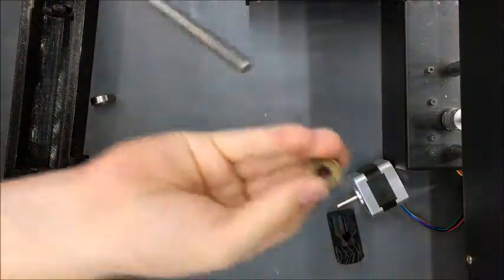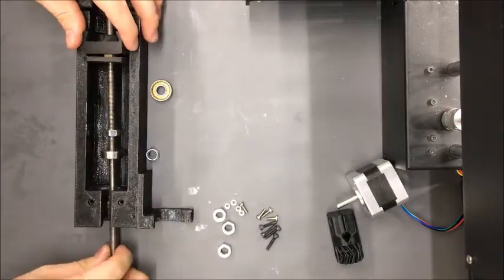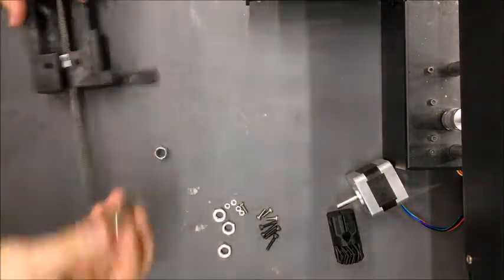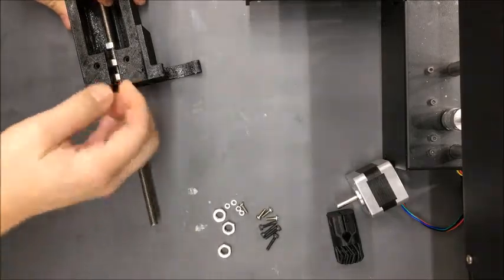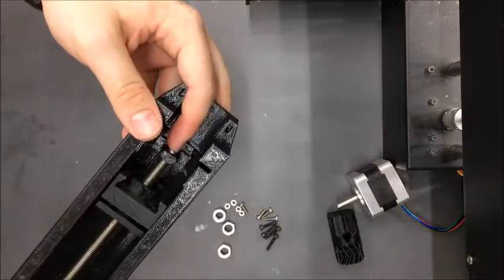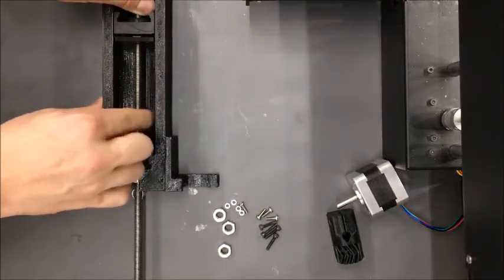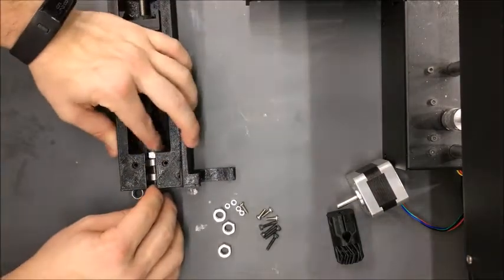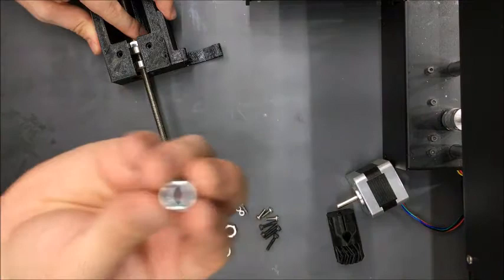Once that's in, take one of these skate bearings and put it on. Slide the entire assembly in and pull the skate bearing into its slot. Put the other skate bearing on the back and push that into place as well. Bring the lead screw until its tip just sticks through the idler bracket, then bring the large hex nut back to the ZZ bearing until it makes contact.